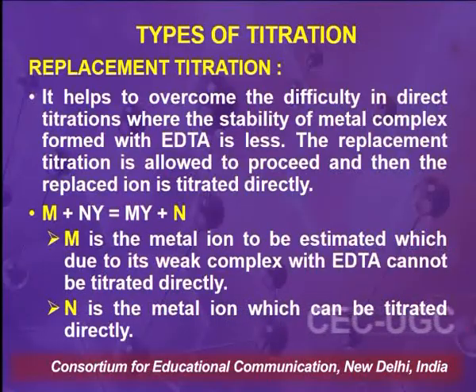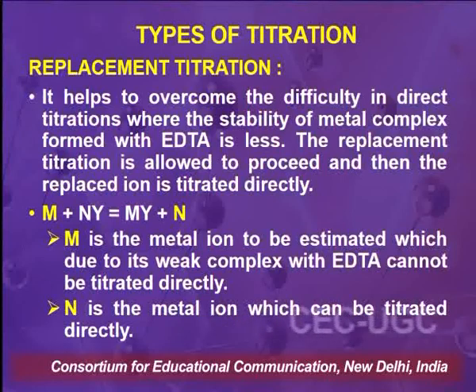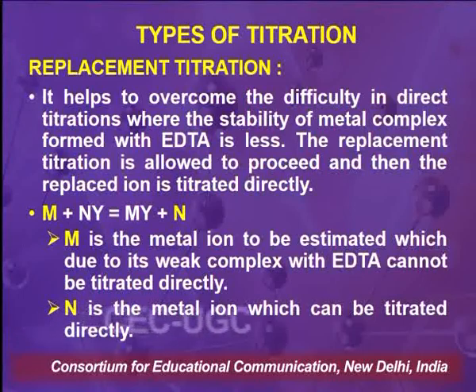Another type of titration is replacement titration. It helps to overcome the difficulty in direct titrations where the stability of the metal complex formed with EDTA is less.